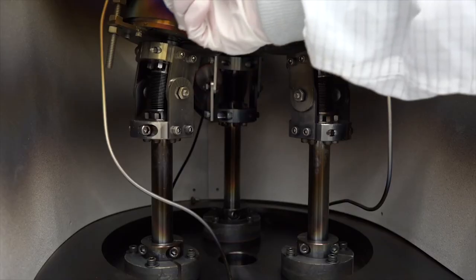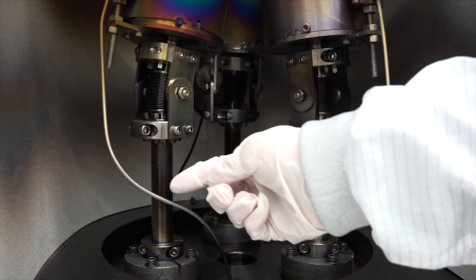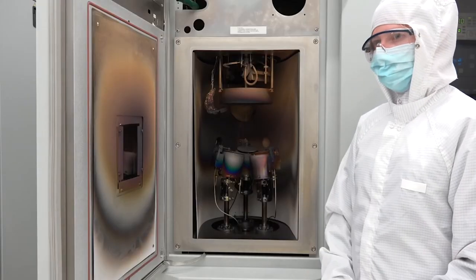The shutter is needed because you cannot quickly turn on or off the plasma, as it can cause the target to heat or cool too quickly and may crack the target material. The shutter allows us to slowly increase the sputter power and slowly decrease the sputter power without unwanted deposition onto the sample. Attached to the target is an electrical lead used to bias the target with negative voltage.